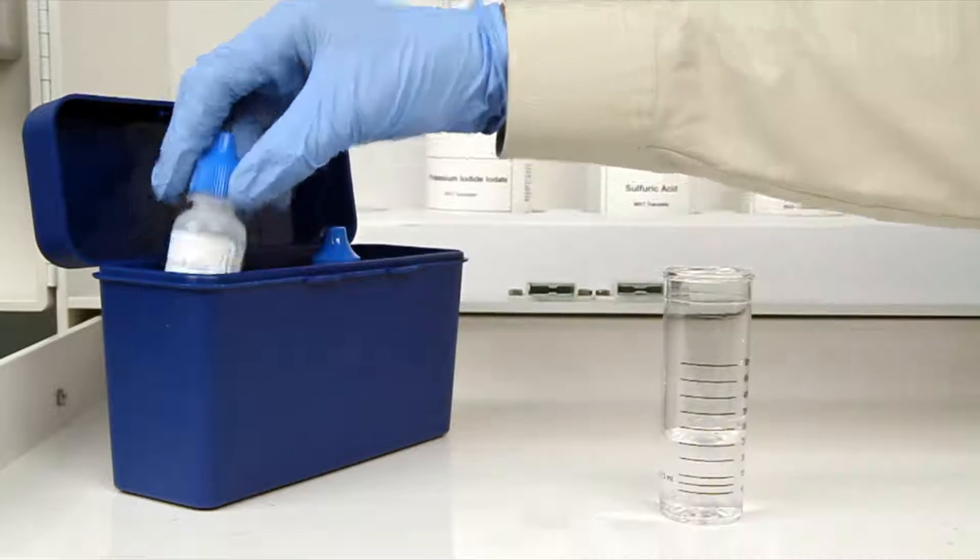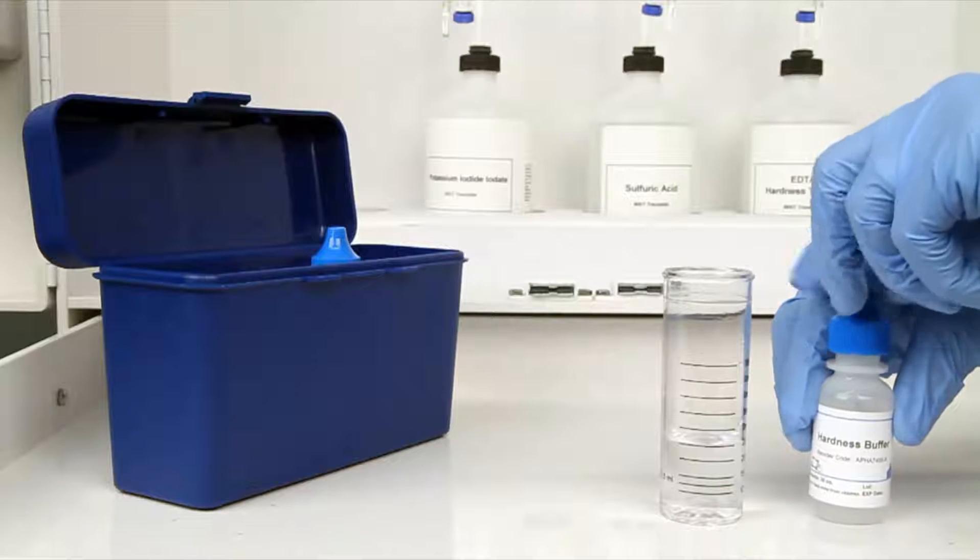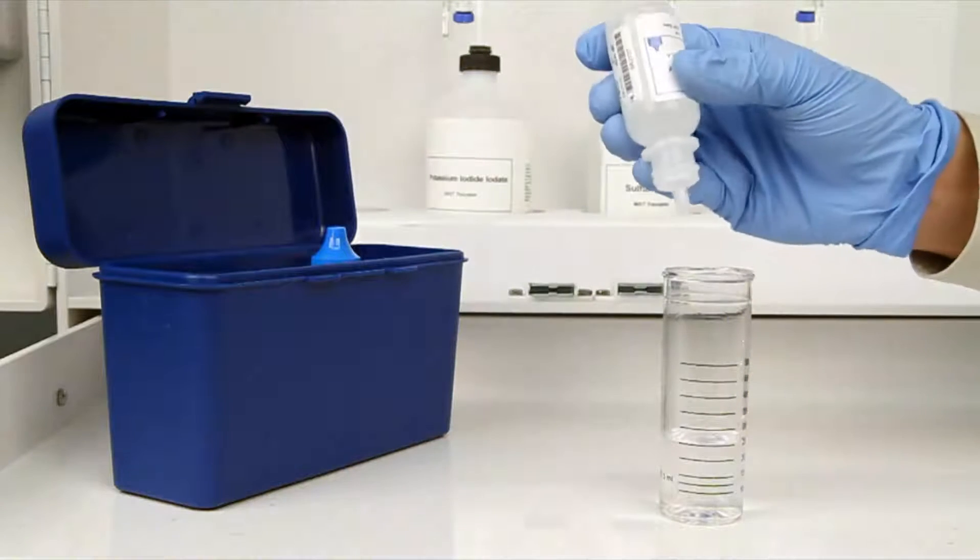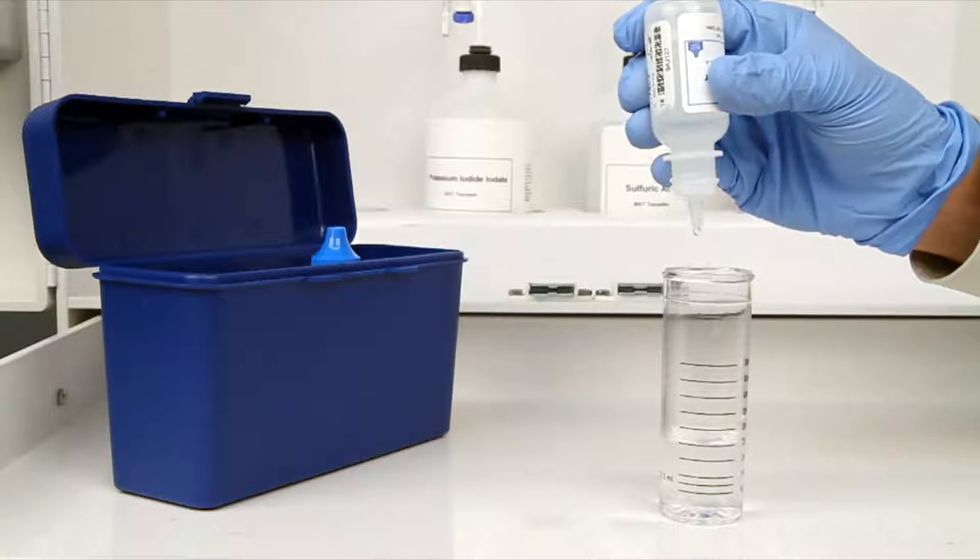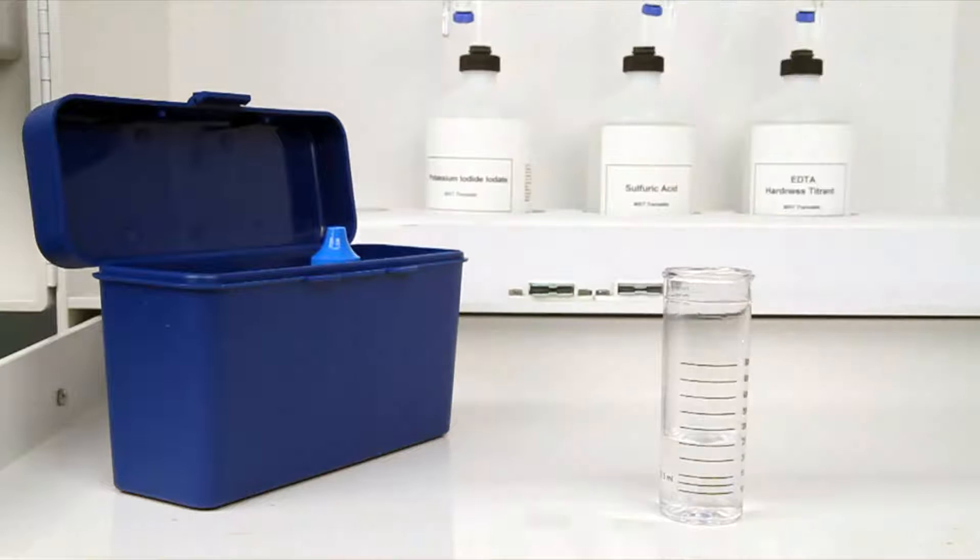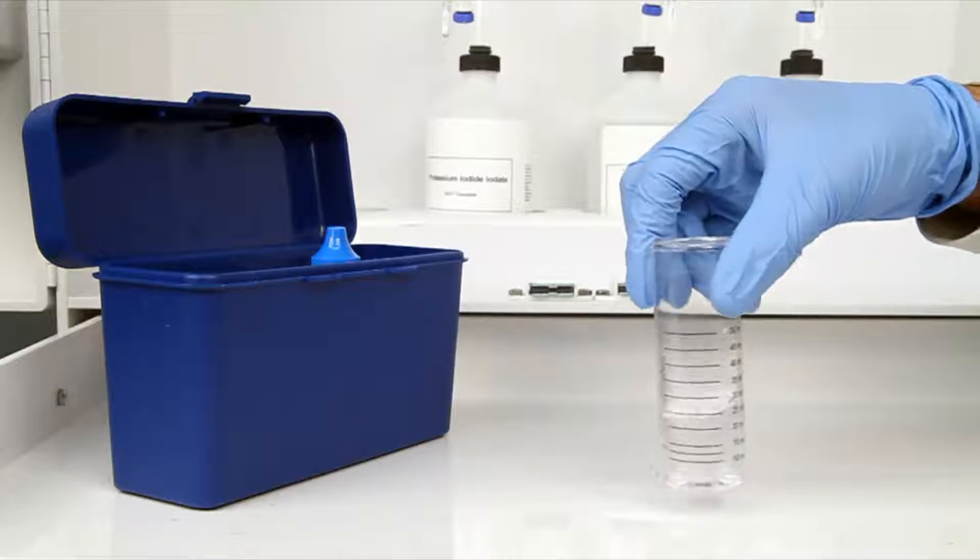The next step according to the Endpoint ID procedure is to add five drops of hardness buffer. The bottle contains a dropper tip, so it's important to hold the bottle vertically to get a consistent drop size. After the addition of each reagent, it's important to swirl the vial to make sure the reagents are properly mixed.